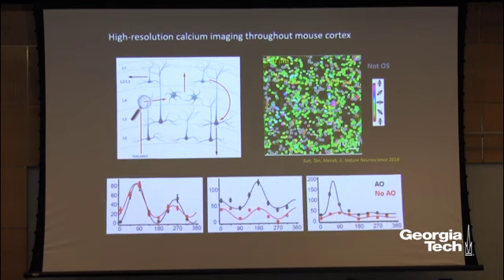Interestingly, if you do the same experiment on the same sample with or without adaptive optical correction, and look at the tuning curve of individual synapses, you see that for some of those boutons, the difference is small. You can see that adaptive optics, the black curves, sharpens the tuning curve a bit. But even before the correction, you could tell that this bouton is orientation selective.